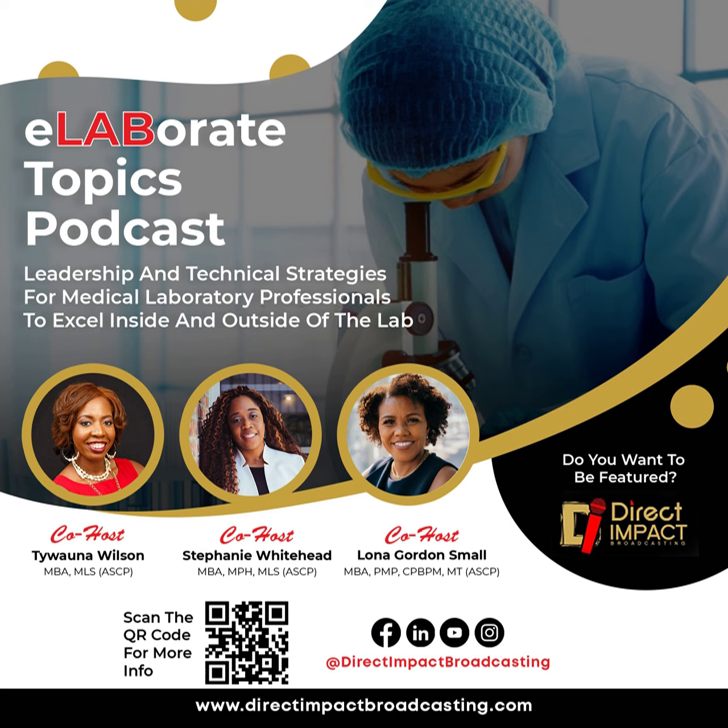And is that sufficient? Or will the end users need to be trained? Is there unlimited access to training modules where we can help update our SOPs? But also with technologists, if I get this equipment, will I need more technologists? Is this going to require a bunch of extra maintenance, a bunch of extra throughput issues where I'm going to need more technologists, or maybe more clerks, or maybe more processors? Or am I going to need less technologists?